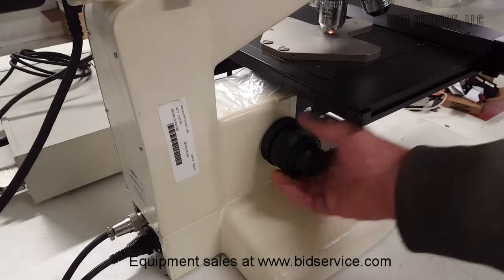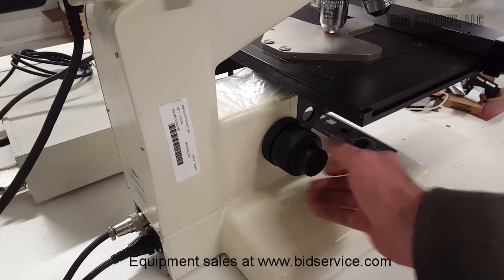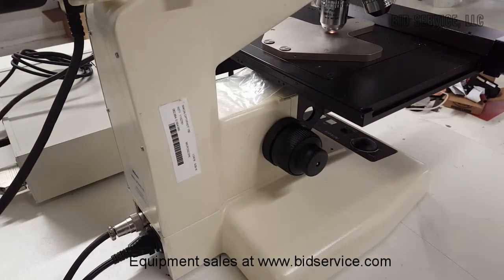And of course, here's your coarse focus and fine focus. I actually put in a new fine focus metal gear.